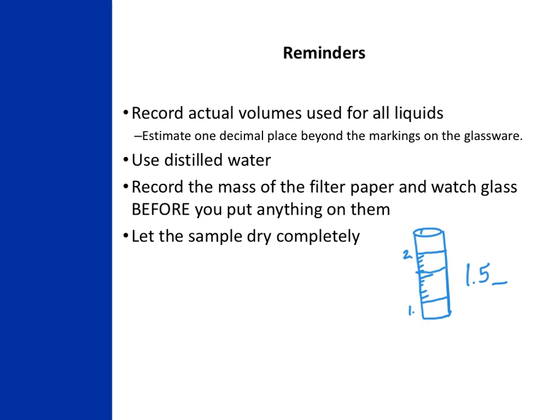Please make sure that you follow your TA's directions on using the DI water tap and that you carefully push the handle downward when attempting to get the water on. Also, the DI water tap is regulated, so please do not force the handle while trying to increase the rate of the water flowing out. You won't get more water flowing out.